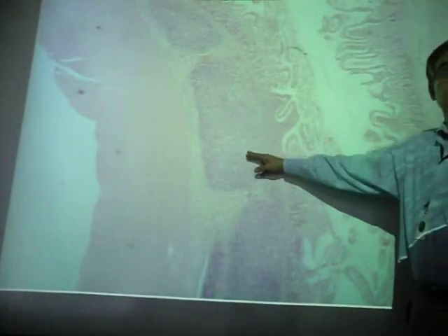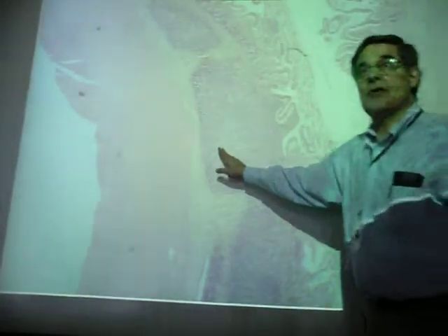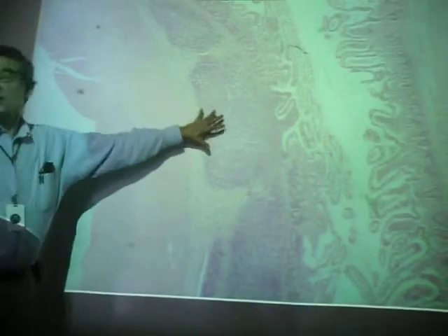And these, again, are collections of lymphocytes. You can see it very distinctly, kind of purple and granular in appearance. What are these? Peyer's patches. The Peyer's patches are in the mucosa here of the small intestine wall, and they actually extend down to what's called the submucosa. What are they? Collections of lymphocytes.